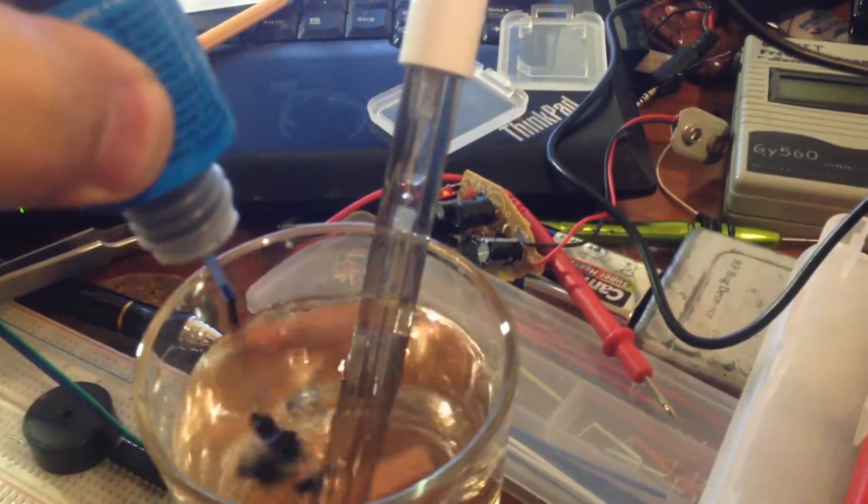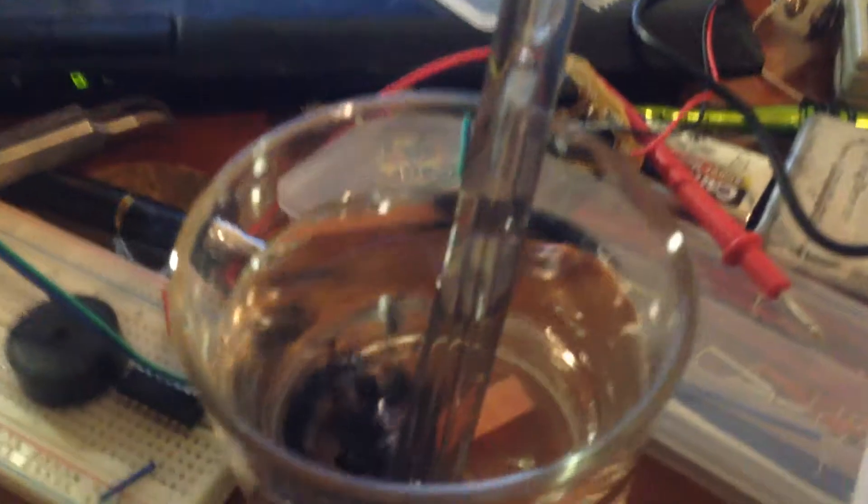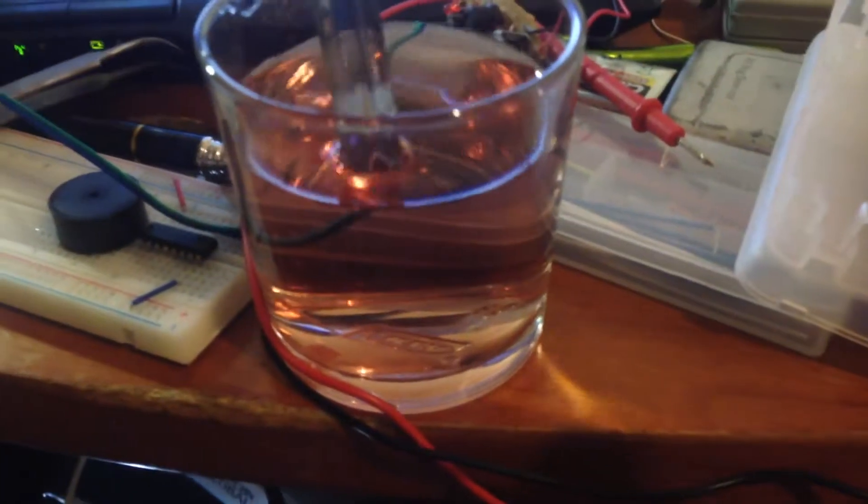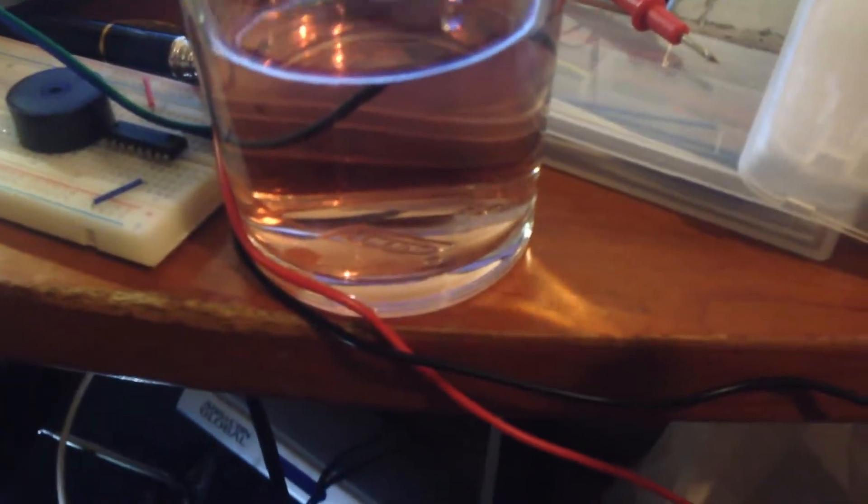I will show you this one. As soon as I add this to water, you can see it's going exactly to change color to pink when I'm shaking. I'm going to add more and shake it more. You can see the citric acid now is completely pink.